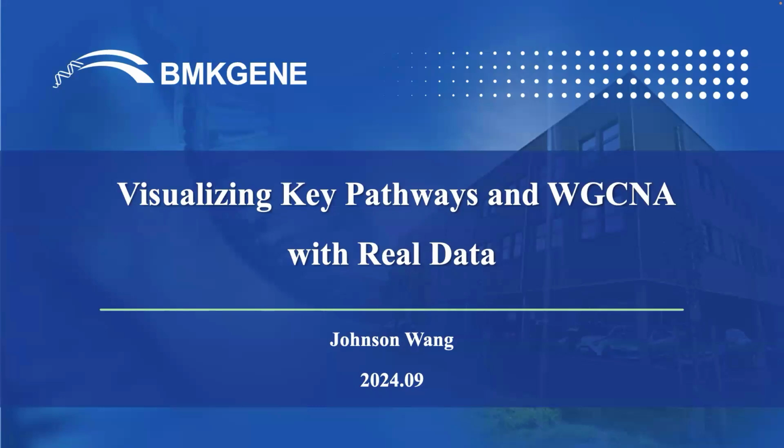In this session, we will explore advanced techniques for enhancing image presentations using volcano plots and heat maps to emphasize key pathways. Additionally, we will conduct a weighted gene co-expression network analysis, WGCNA, to identify important gene modules and interpret their biological significance using real data. We will cover the following topics in detail.